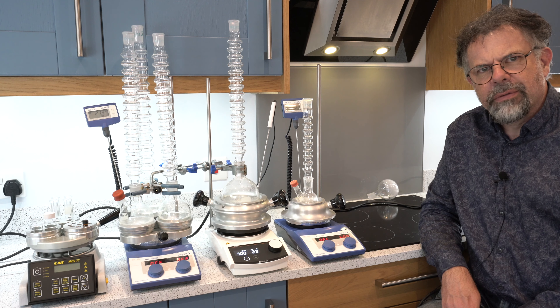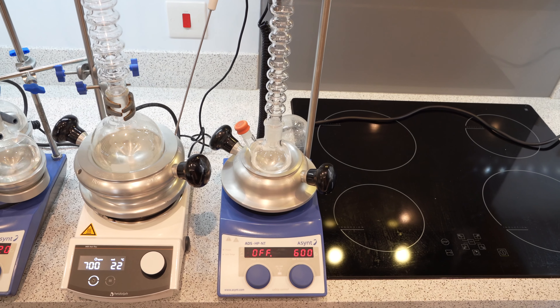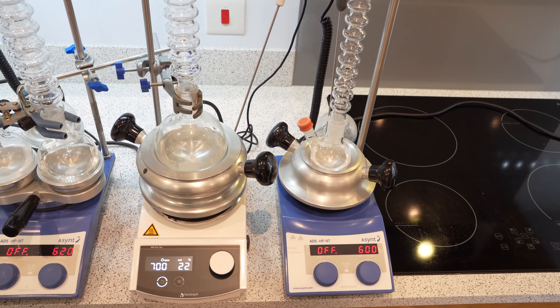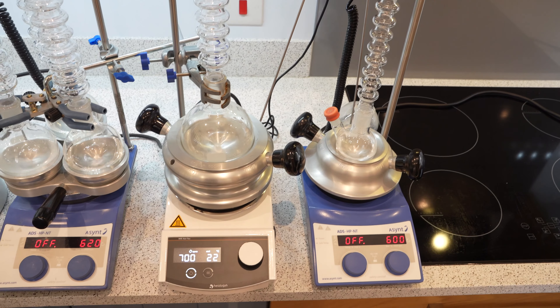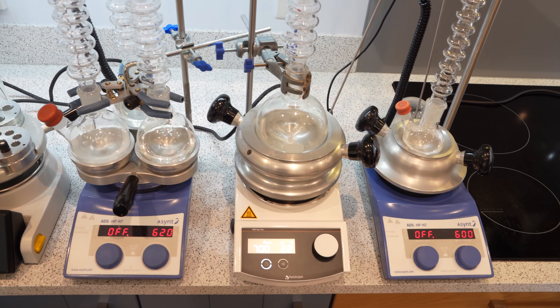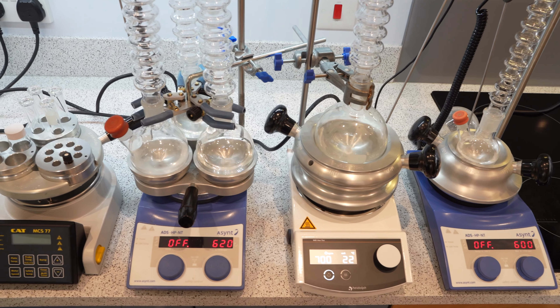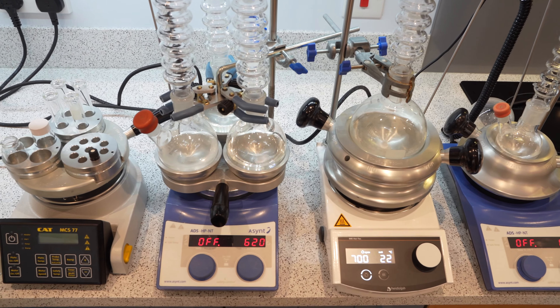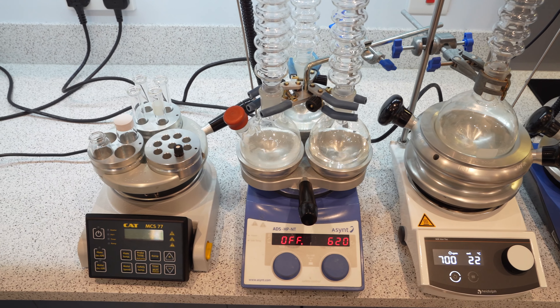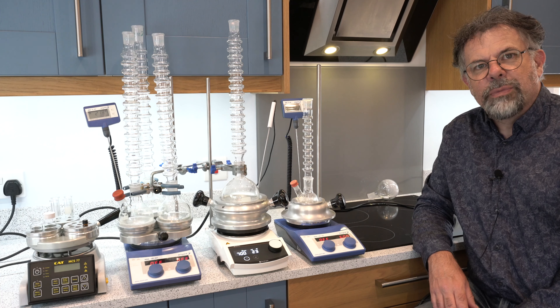So what is DrySyn? Well DrySyn allows you to use a standard magnetic hot plate stirrer from any manufacturer to heat and stir a round bottom flask of pretty much any size — in a single formation one at a time, or do multiple experiments up to three round bottom flasks at a time, and also at the far end, as you can see, a unit for doing tubes and vials. So a very flexible system.